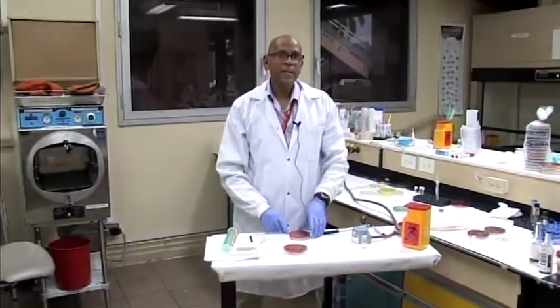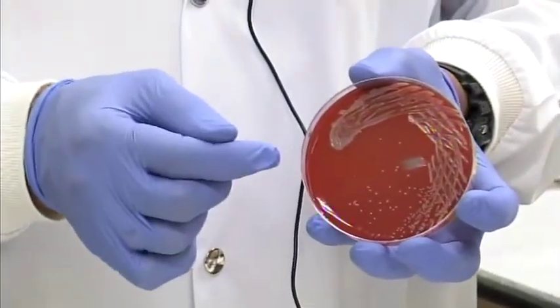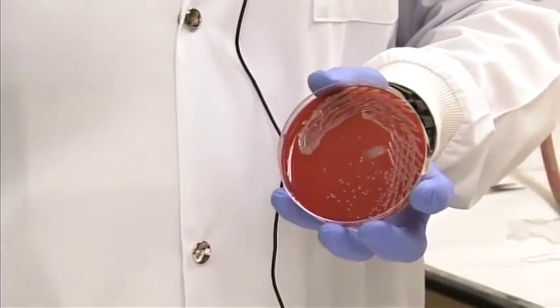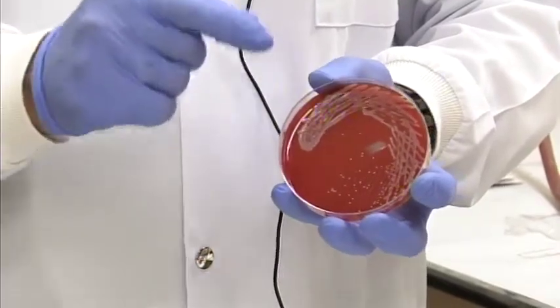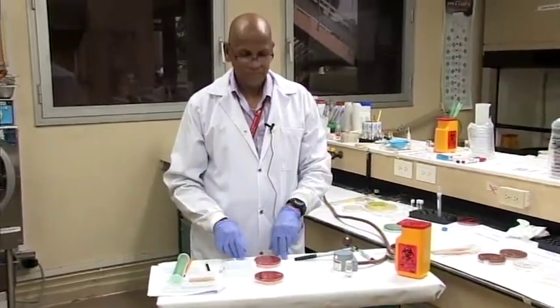So all plates are incubated at 35 to 37 degrees, for 18 to 24 hours of growth. The next day we remove those plates, and hopefully we can see an end product, something like this here, where the streaking would have revealed dilution of the organisms to create what we call colonies. So what would have happened overnight is where one bacterium was moved to the plate, that one bacterium multiplied exponentially to create hundreds or thousands of bacteria on that one spot. So every single spot here is what we call a colony. And those are colonies we need to use in the lab to do our different tests, etc.